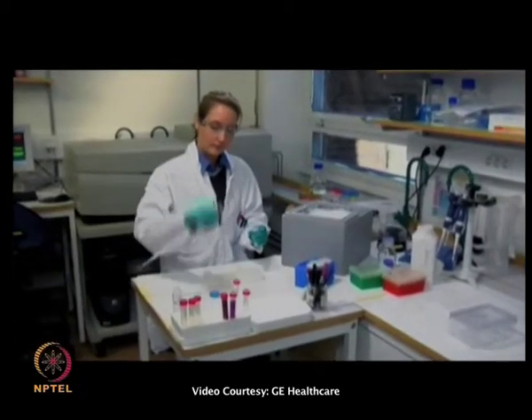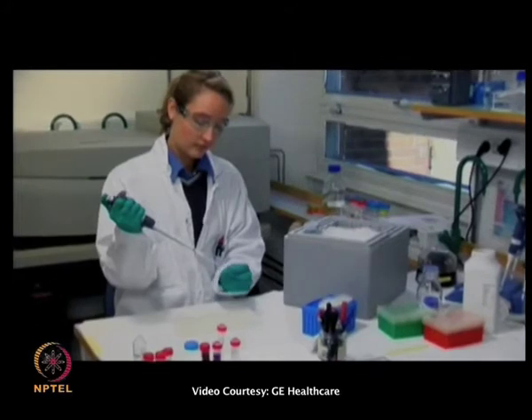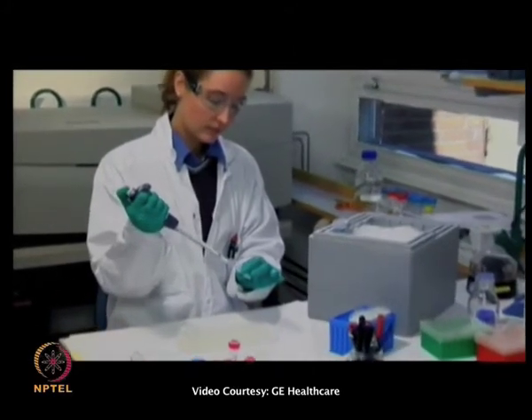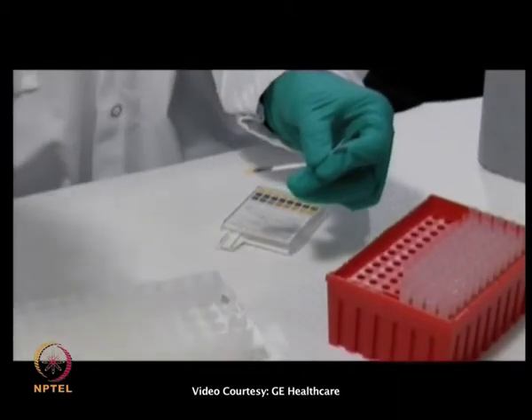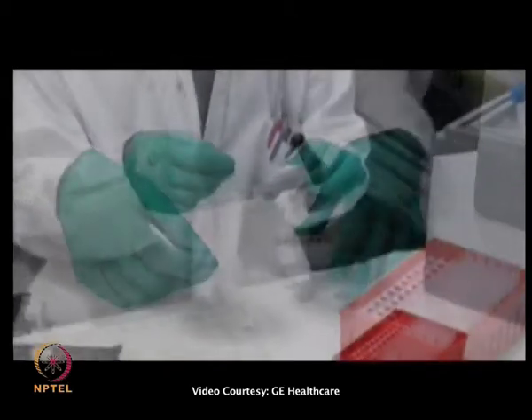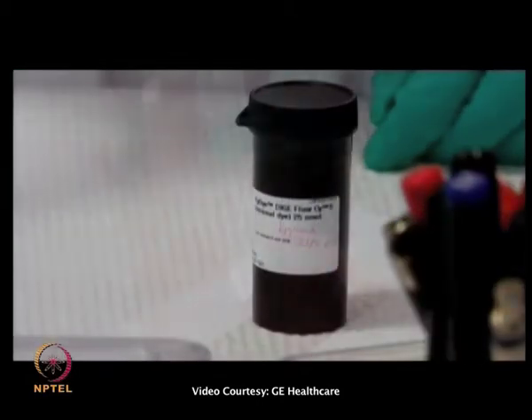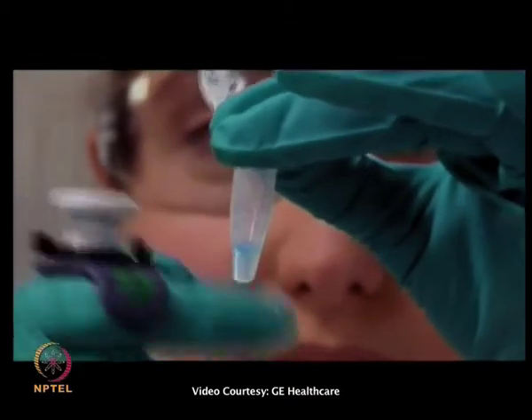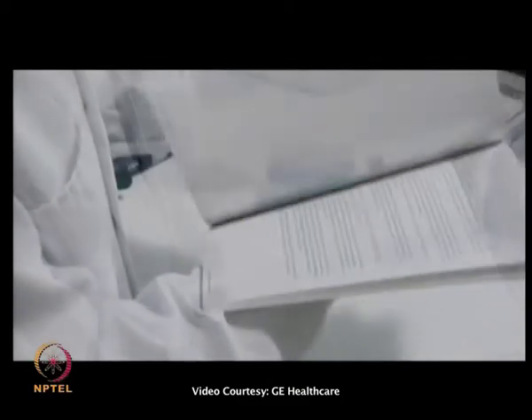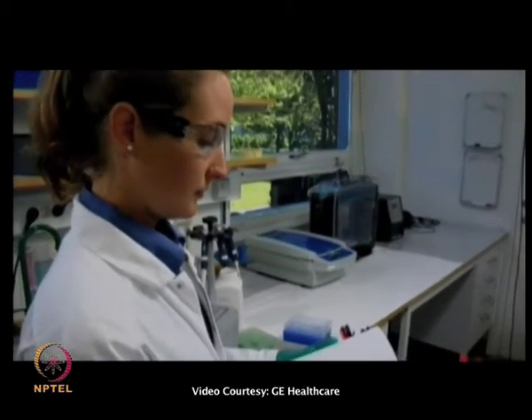After the wash, the cell pellet is resuspended in 200 microliters of ice-cold labeling buffer containing HBSS pH 8.5 and 1 molar urea for optimal labeling conditions of cell surface proteins. Always check pH before labeling. We used 600 picomoles CyDye for 10 million CHO cells. The optimal ratio of CyDye to cell number will vary depending on the cell type, since we do not know the exact protein concentrations on the cell surface. How to determine the optimal conditions for CyDye labeling of proteins is described in the 2D Electrophoresis Principles and Methods Handbook.